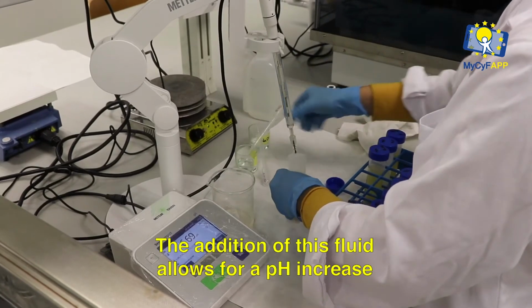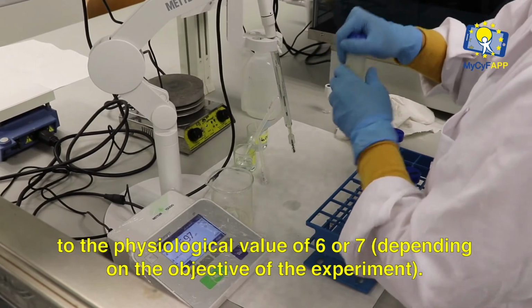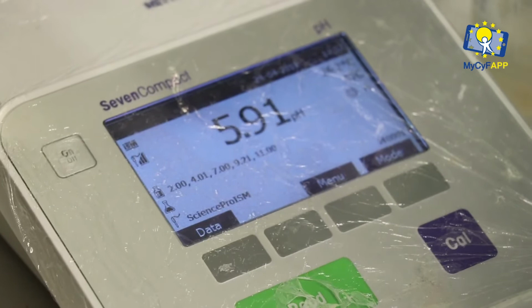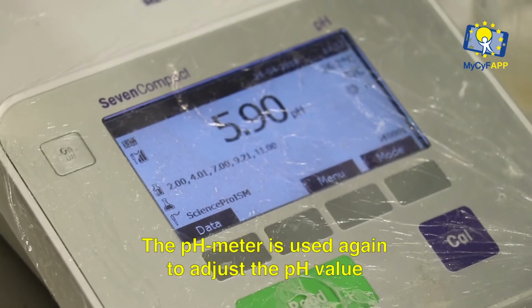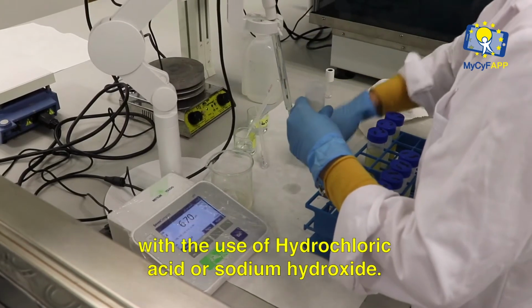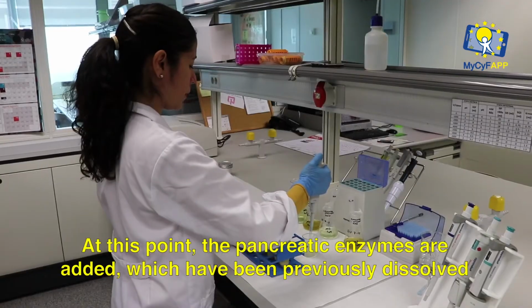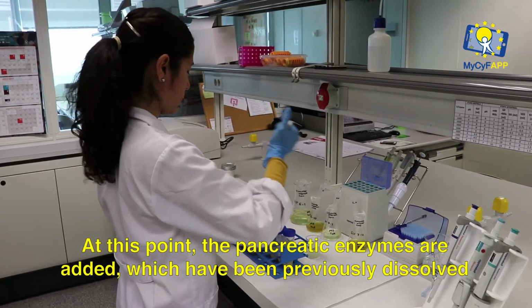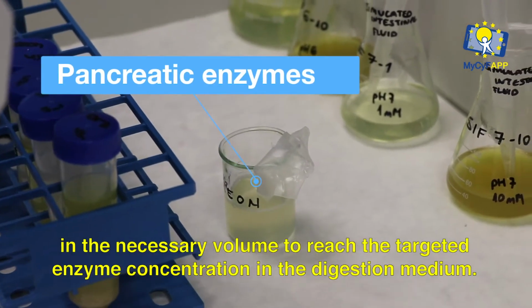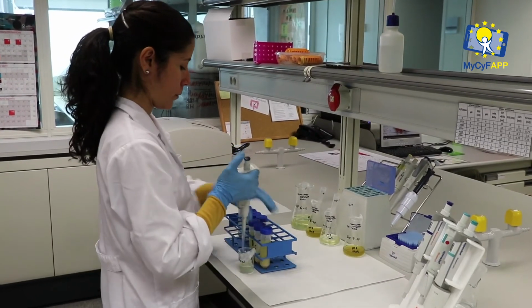The addition of this fluid allows for a pH increase to the physiological value of 6 or 7, depending on the objective of the experiment. The pH meter is used again to adjust the pH value with the use of hydrochloric acid or sodium hydroxide. At this point, the pancreatic enzymes are added, which have been previously dissolved in the necessary volume to reach the target enzyme concentration in the digestion medium.